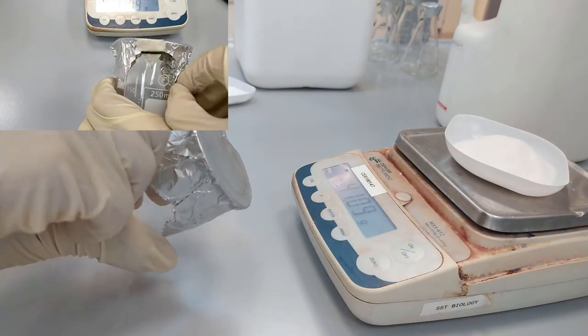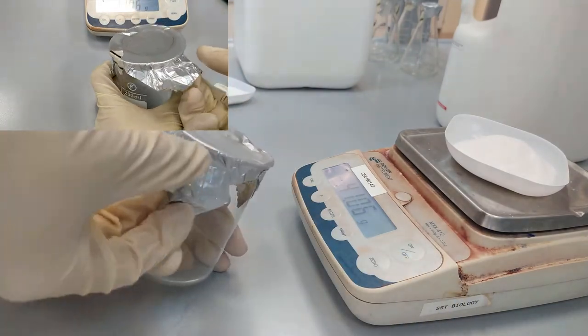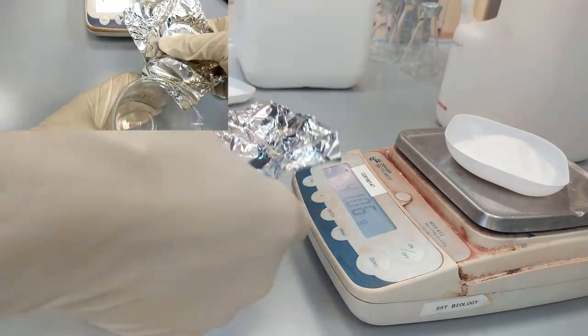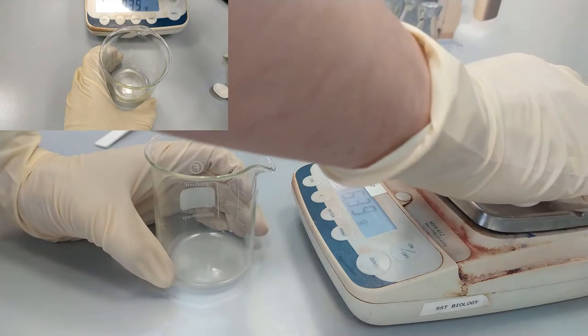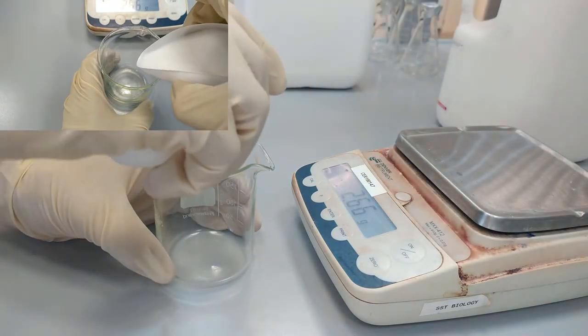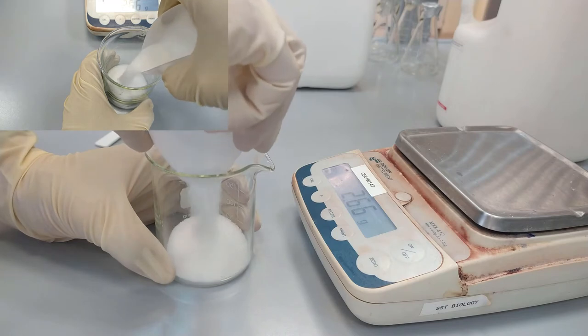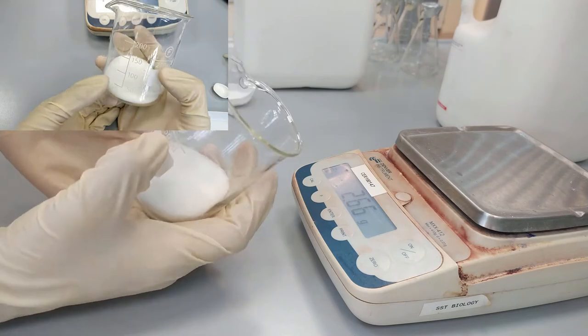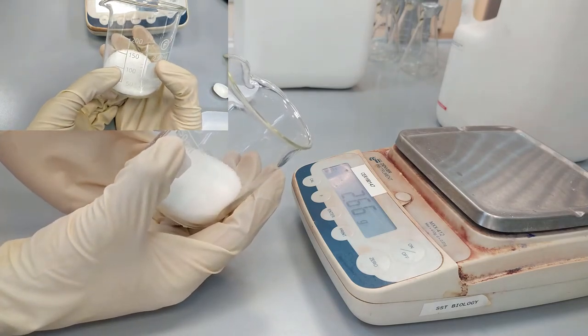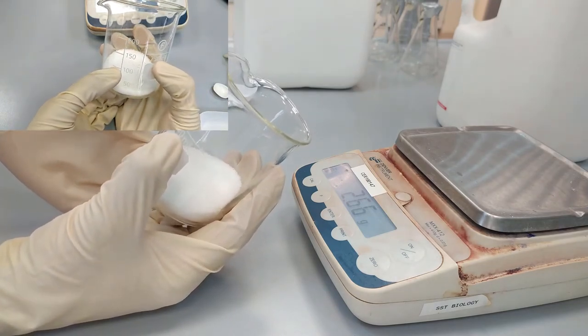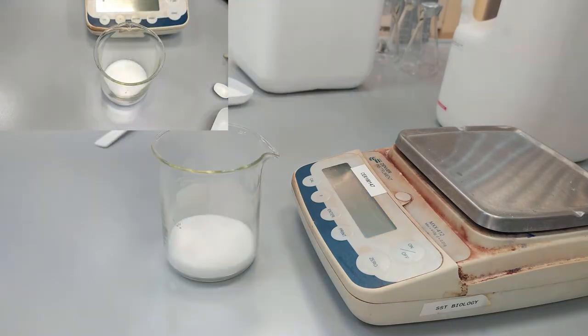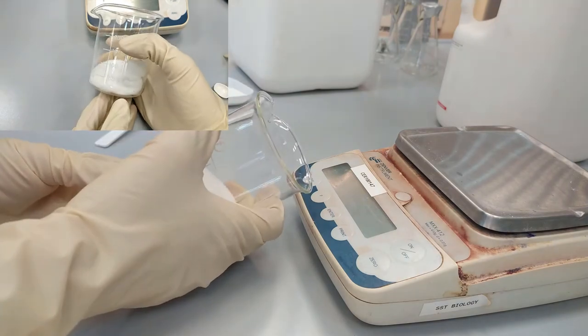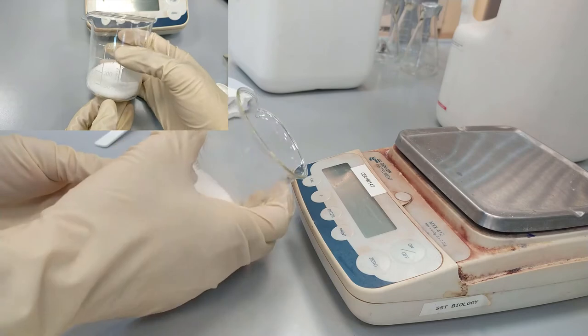As you can see here, we take 250 milliliter beaker, put all sucrose inside, and then add to the volume of 100.